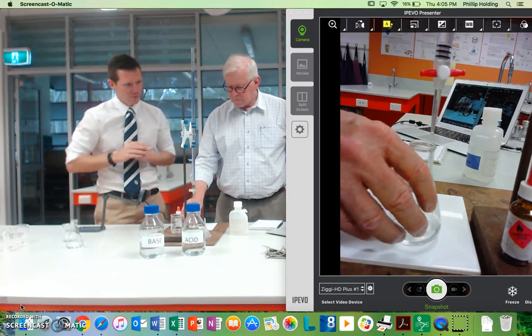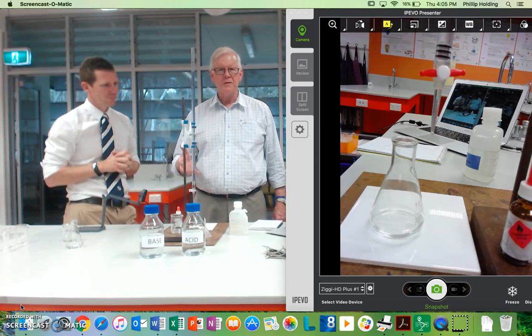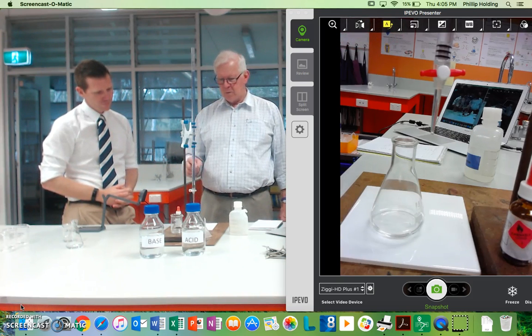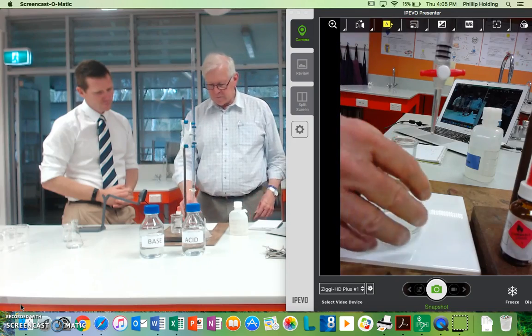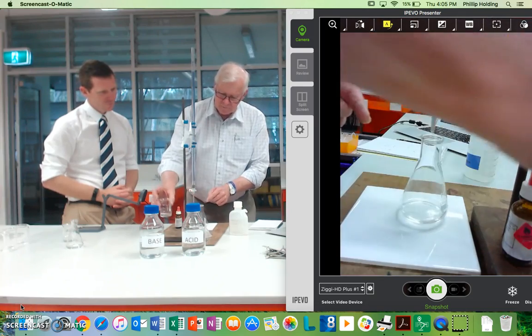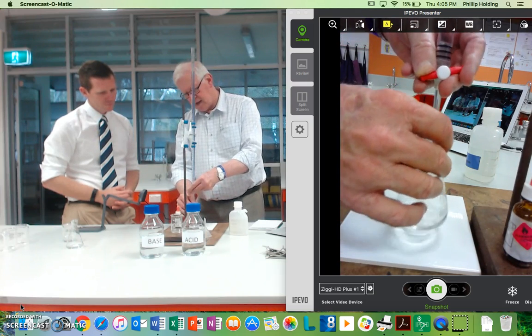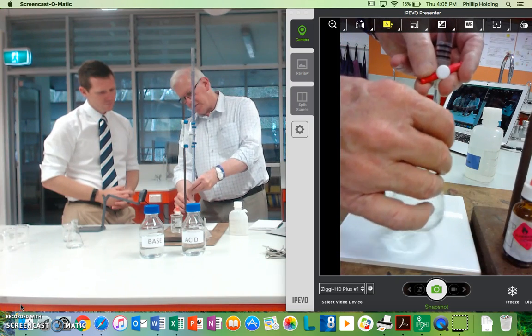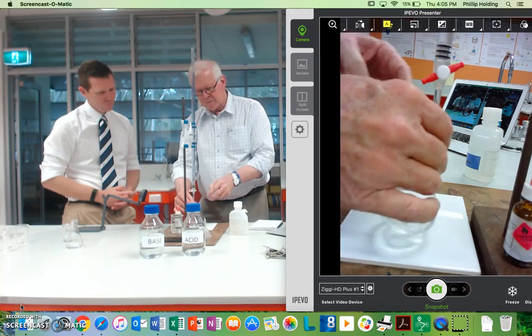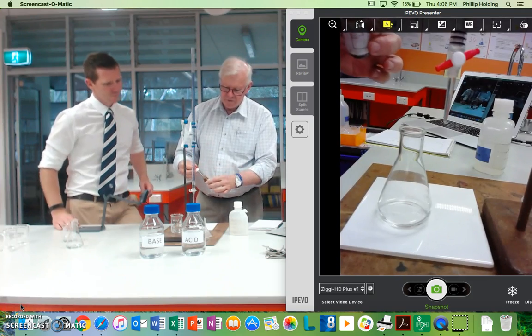Because we've done everything so far, everything is right and ready to go. It's a bit like painting — if you prepare the surface correctly, then the painting is the easiest part of it. So we get down to this, we're ready for action, we want it to be accurate. I notice there's a drop on the bottom of that, I'll just take that drop off. I use one hand and my thumb to move the tap. We put in three drops of indicator and we're ready for action.